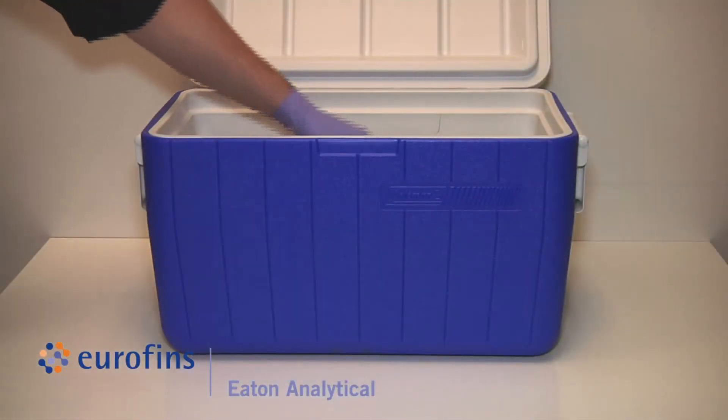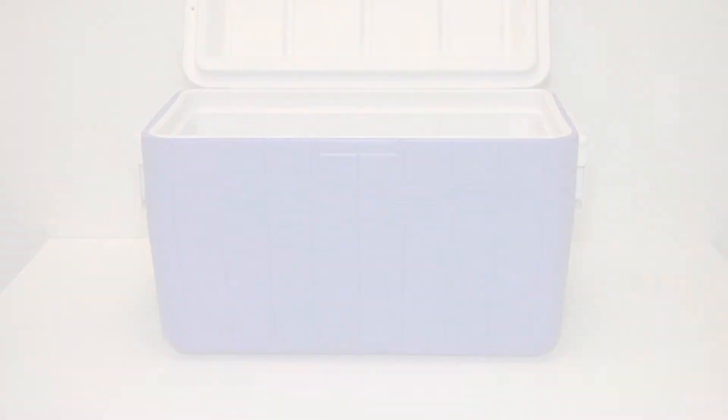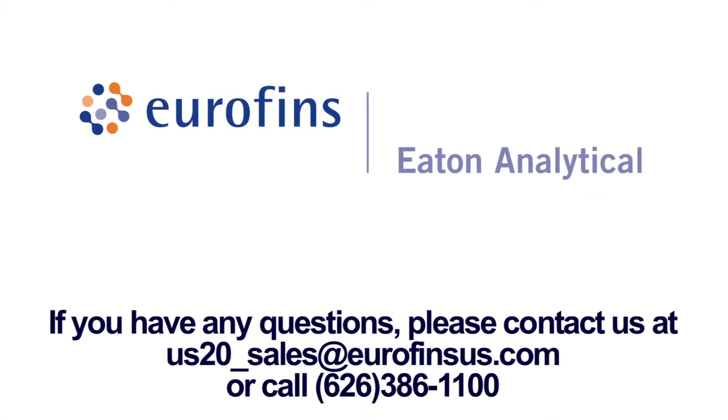Place the sample into the cooler and ship back to the lab. Please refer to Eurofins Eaton Analytical's written sampling instructions for specific details.